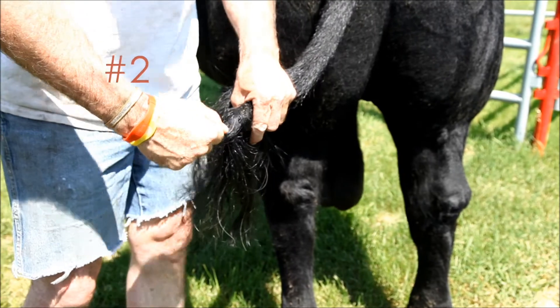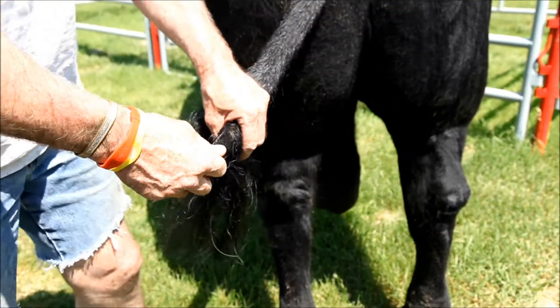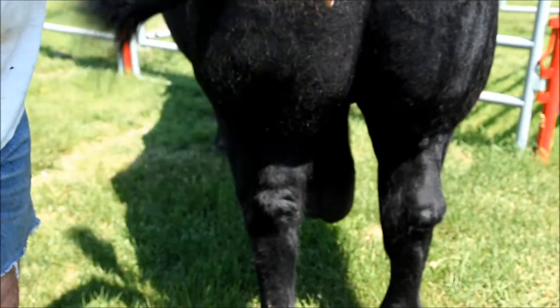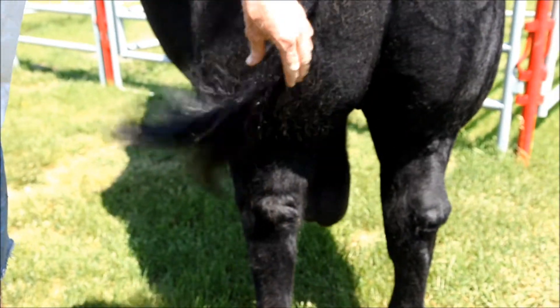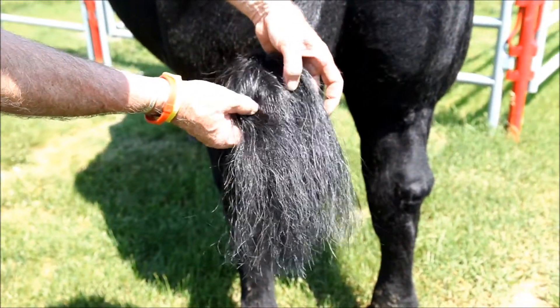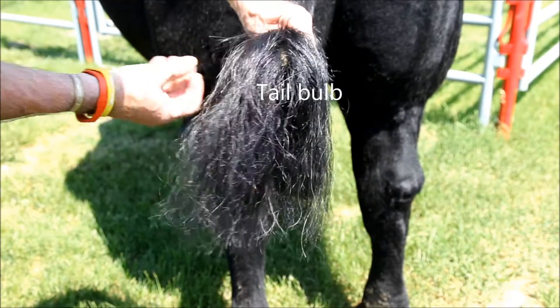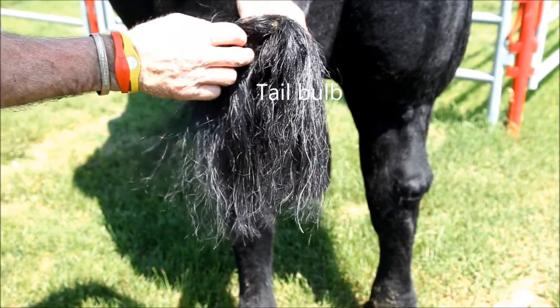After you've got your animal in a secured location, you might want to check its tag or tattoo numbers just to double check that you have the right animal in the chute to begin with. Next, you're going to brush out the tail. Just make sure that it's clean of urine and manure, and it's best not to wash the tail just before.